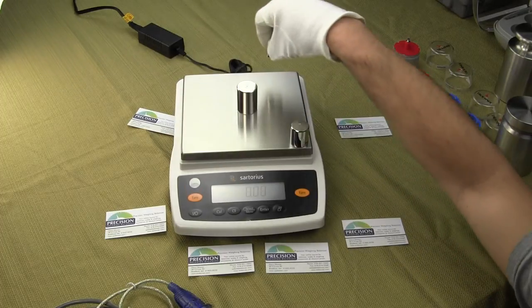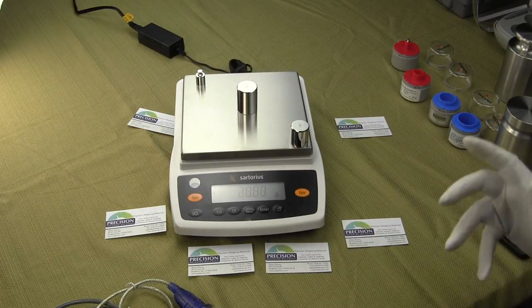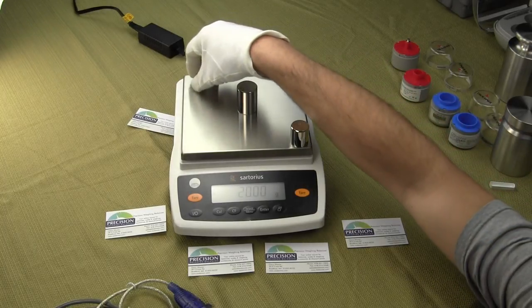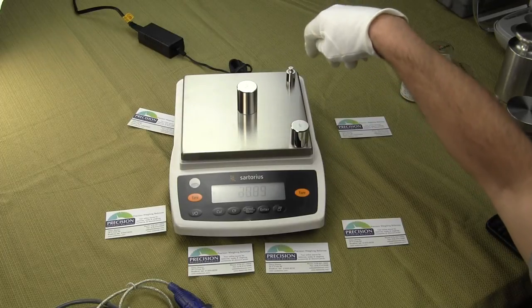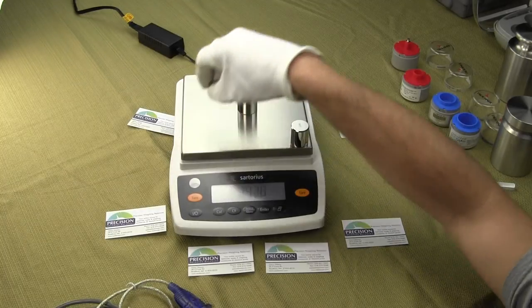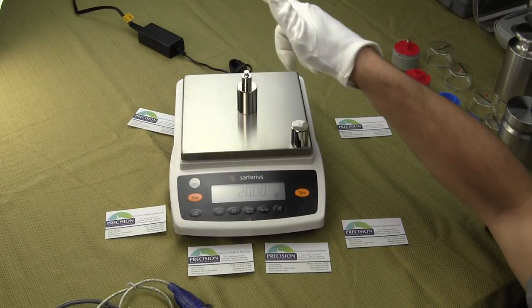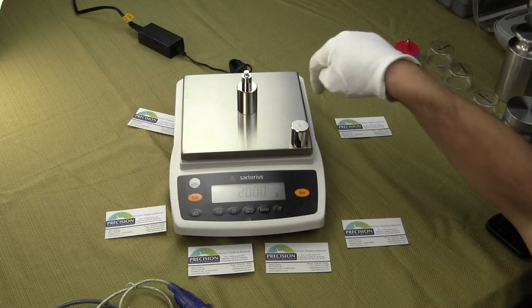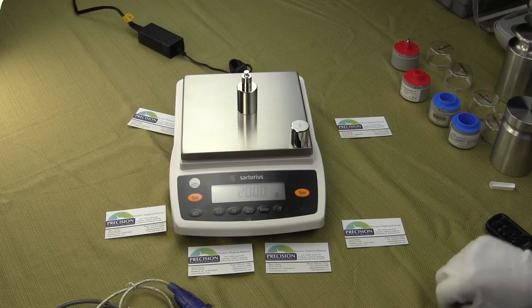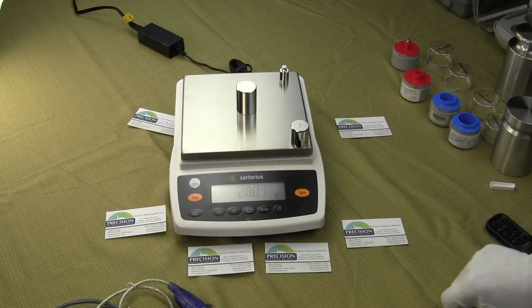There are a lot of balances on the marketplace — no-name brands — and if price is everything, when you buy it, put some test weights in all four corners and see if you get repeatable results and see how fast the balance is. Sartorius holds the Guinness Book of World Records for the most accurate balance in the world. This particular Entrance is using Sartorius' monolithic cell — it's a single block of aluminum — superior weighing technology.